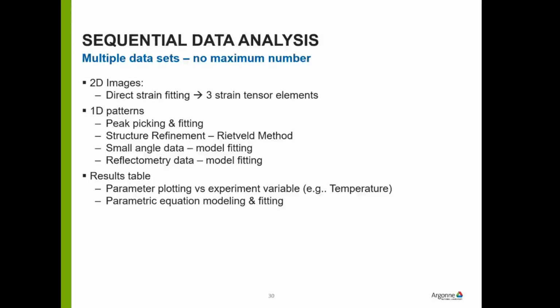If you have the model correct, the two methods will give you exactly the same result. But this is a lot more robust, and it also avoids surprises.